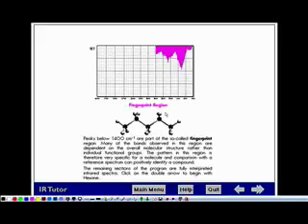The other place that they use it is in the identification of fibers from clothing. I had to do this for the football field over the summer, because apparently in the spring there was this big concern that football fields were full of lead, and the ones that were full of lead were made of nylon. They couldn't find the receipt from when they bought the football field, so they didn't know whether it was nylon or polyethylene. It was easy enough to grab a handful of green stuff from the field, put it on the infrared, and determine whether it looked like polyethylene or nylon.